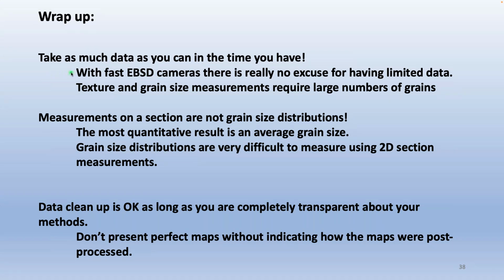Taking small areas that you can do in an hour or something like that may not be adequate. If you have a fast EBSD camera, take a lot more data. Make the effort. Texture and grain size measurements require a large number of grains to be measured. I think this is important. A lot of people don't take enough data to get accurate texture, or I should say globally representative textures and grain sizes.